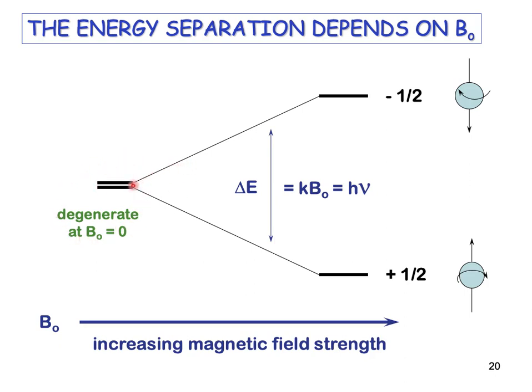When we place the nuclei into the magnetic field, the levels split: one is the lower energy level and the second is the higher energy level. Remember, we are only interested in the nuclei of an atom. So these levels are generated when the molecule is placed under a strong magnetic field.